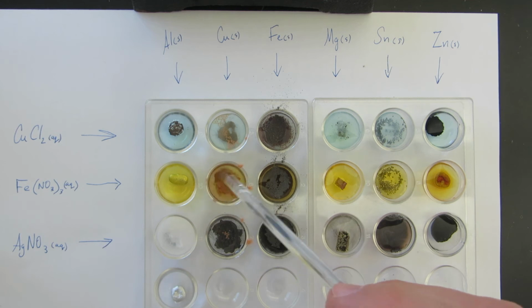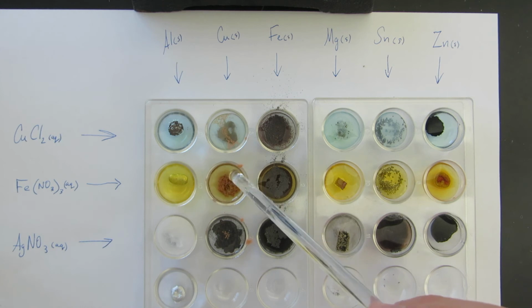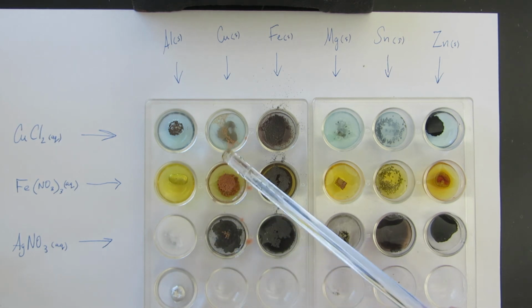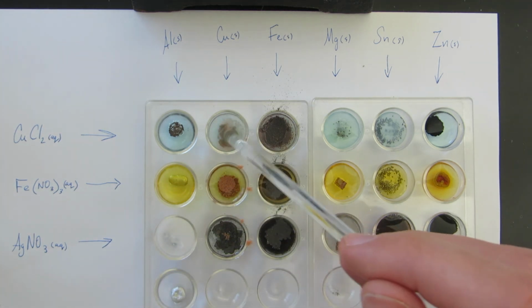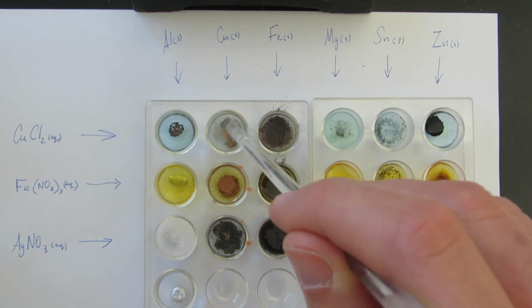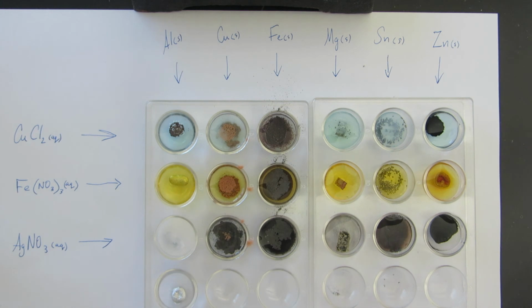I'm not seeing anything here. Copper looks like it's just sitting at the bottom of the iron nitrate. I didn't mean to mix in the iron nitrate. I'm not seeing, something looks like it might be going on with this copper. Copper does form more than one oxidation state, so maybe we'll get something, but usually you just ignore these, right? Copper and copper chloride, we're not trying to see which one's more reactive.